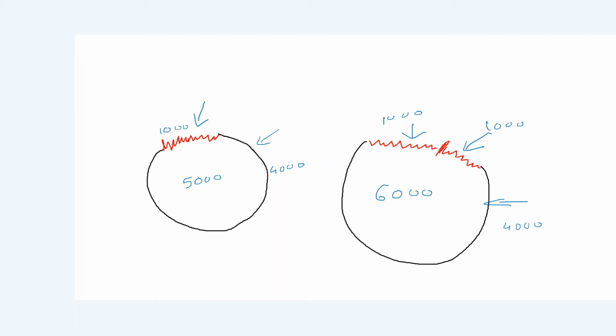Also the orientation. What if this was 3' here and 5' here, but you wanted 5' and 3' insertion. So if the direction of the insertion is not correct, that also you can evaluate by plasmid mapping.